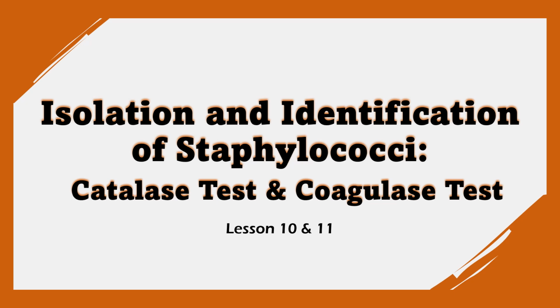So good day everyone. So for this week's lesson, we will be discussing isolation and identification of Staphylococci, specifically focusing on the Catalase test and Coagulase test.